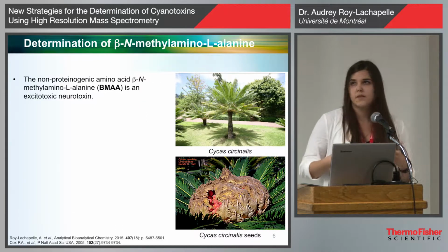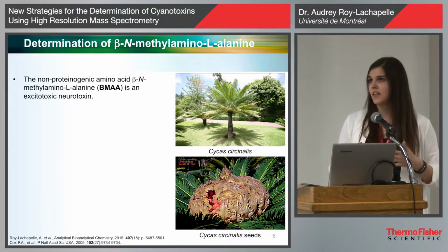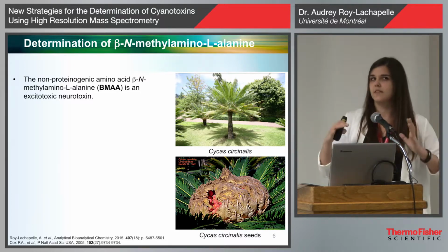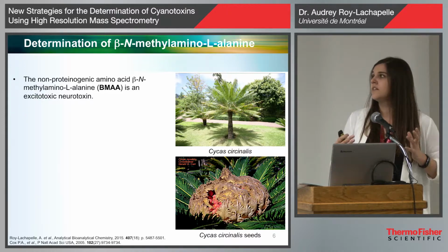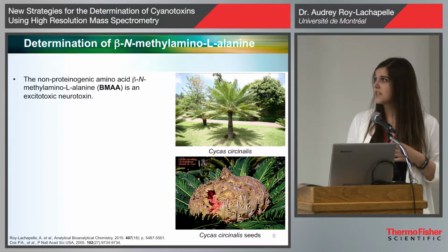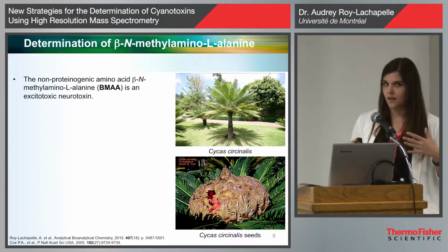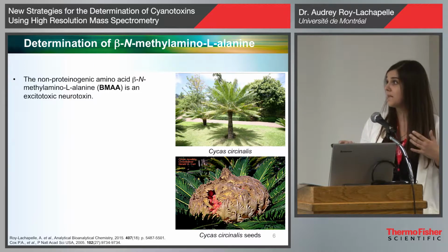So my work was mainly to have a better, more specific detection, and also to group more toxins in one analytical method to be more specific and precise in the detection. I will present you some of the methods that we developed in the lab.